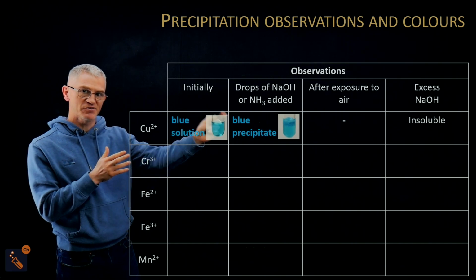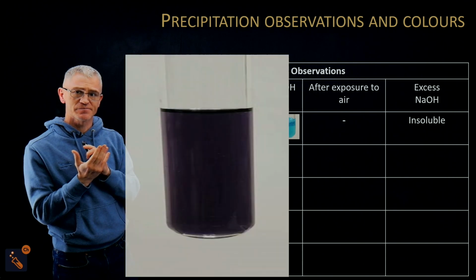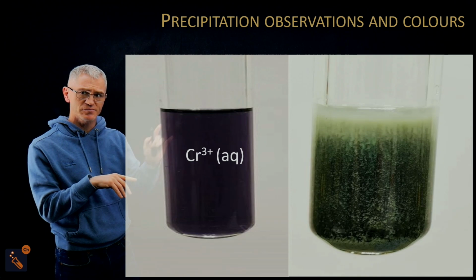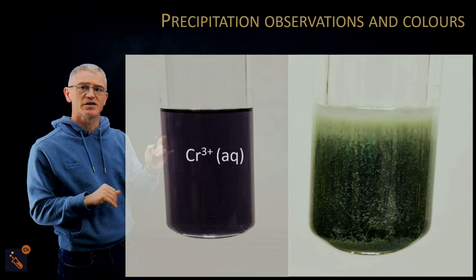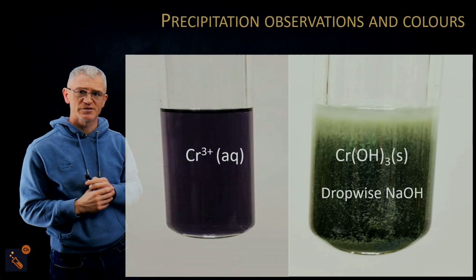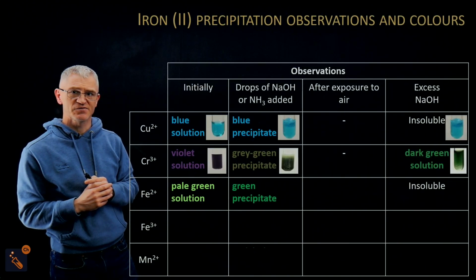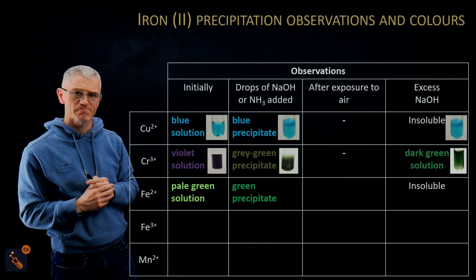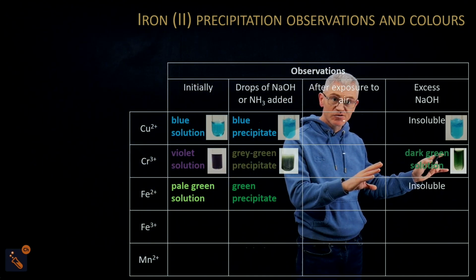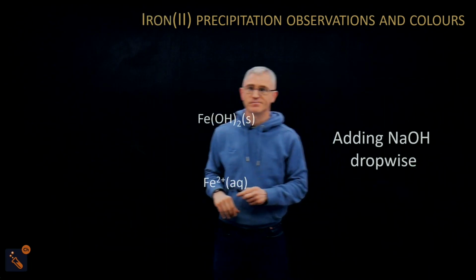Okay, so we've added now that ammonia there so you can see. Now, next thing is you've got this, which is chromium, which is your purple, okay, or your violet, sorry, and your violet going to grey-green precipitate, which is dropwise sodium hydroxide. Okay, which you hopefully have seen before as well. Now, going towards this grey-green, it's a dark green, sorry, that we've all talked about before.